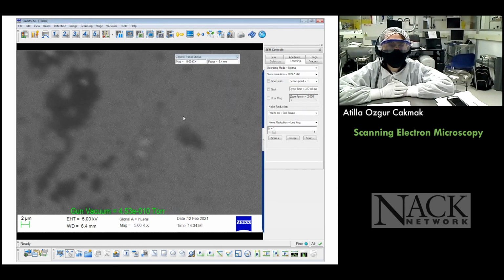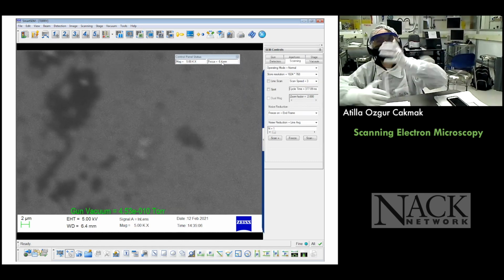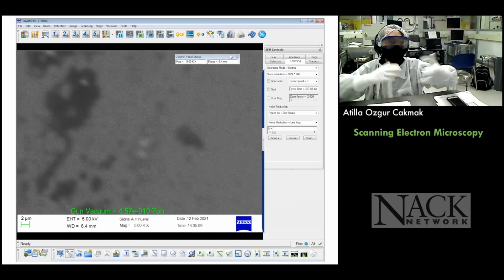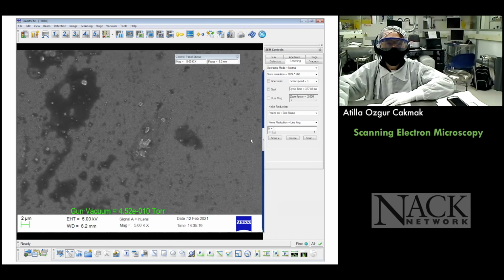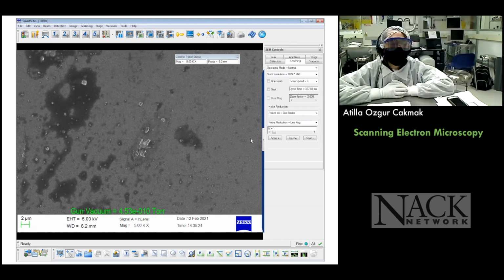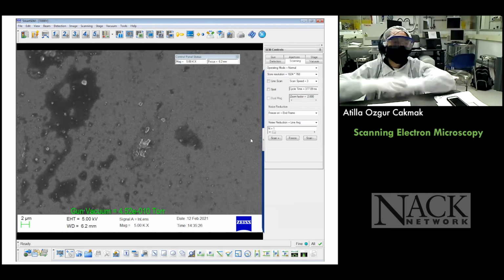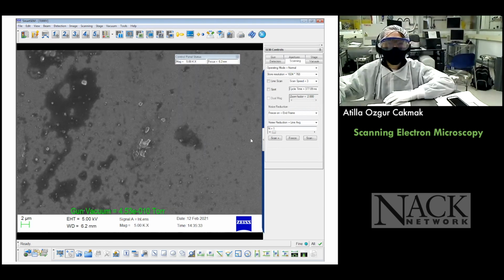So now we've seen that we've magnified. What's going on? It's just like the optical microscope. You now switch to a higher magnification or a higher lens, right? You have to refocus. Exactly, you have to refocus. So since you have the mouse pad, I'll help you with the focusing, but then I will ask you to magnify more, okay? So let me help you with the focusing a bit. Perfect. Now, at this point, I ask my students, did we end up with the nanoparticles or not? Some say yes, some say no. What are we going to do? We're going to do, as scientists, some actual measurement, right?